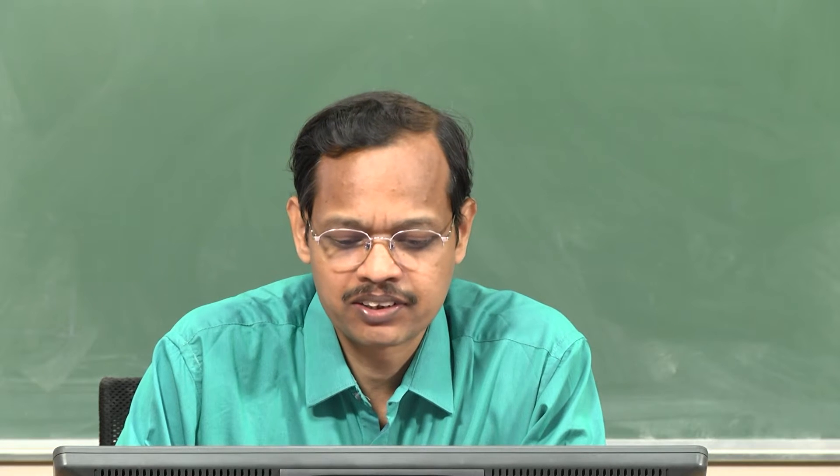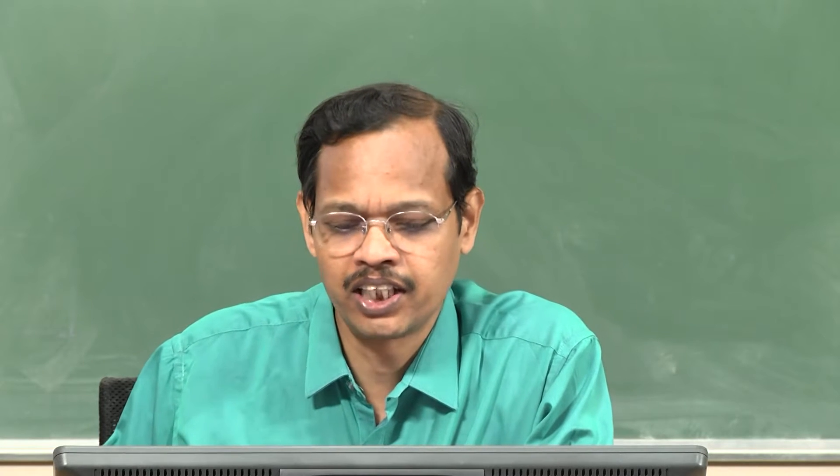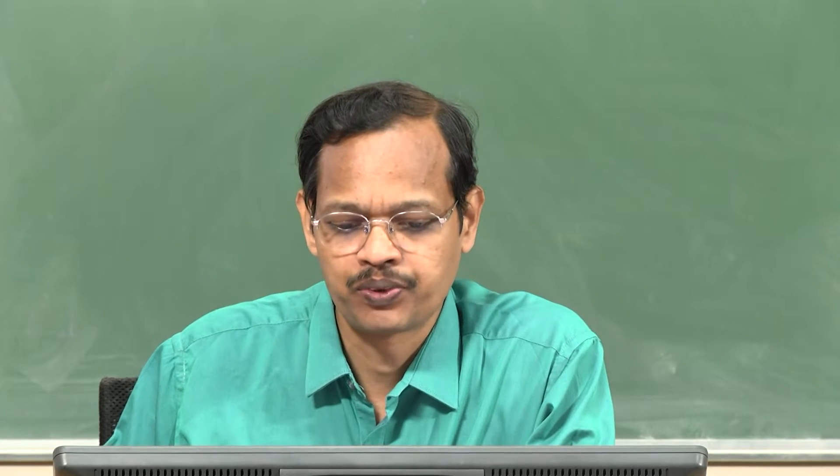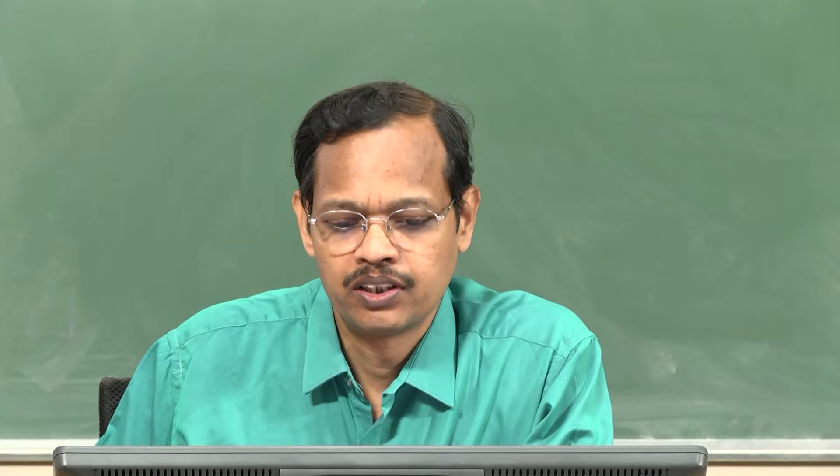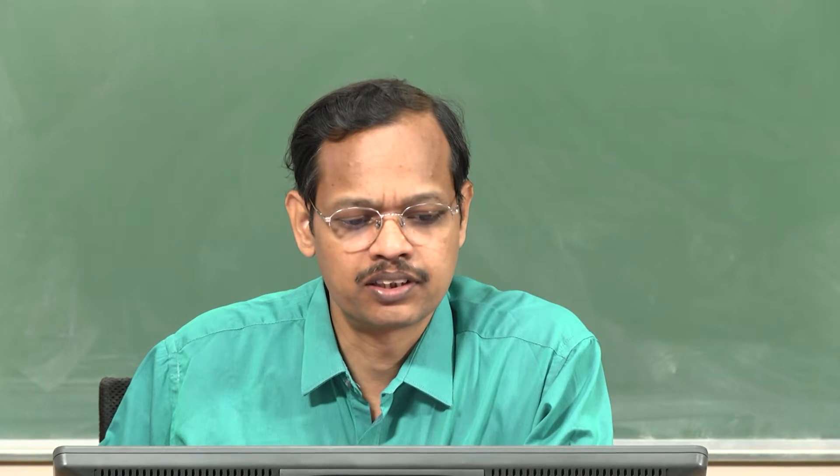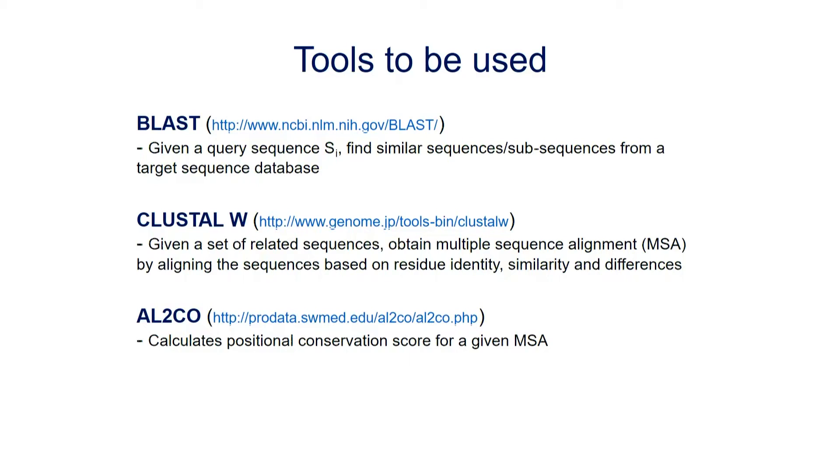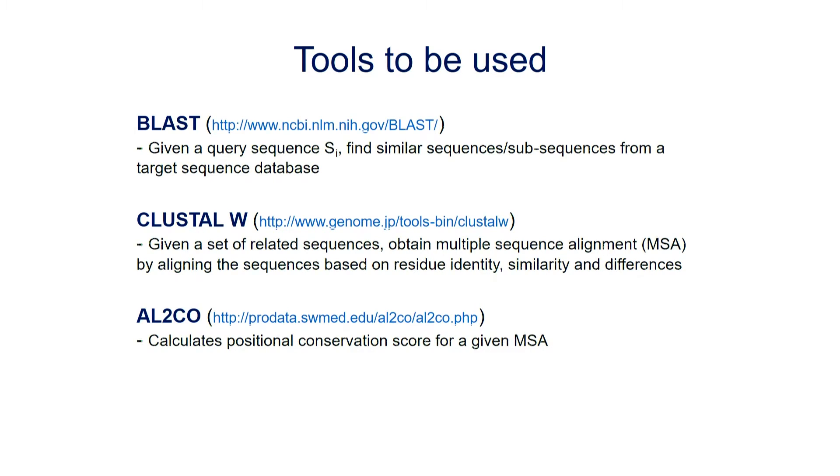Demonstration on BLAST, ClustalW and AL2CO. In this demo, we explain about three tools such as BLAST, ClustalW and AL2CO to obtain similar sequences, multiple sequence alignment, as well as the conservation score.